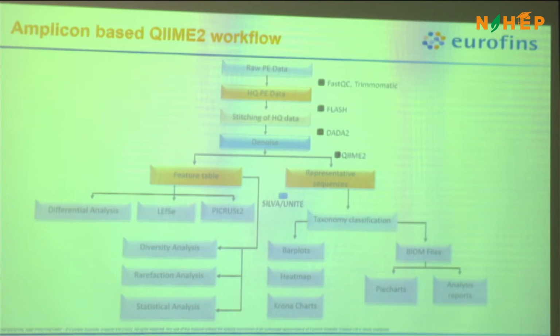of R2 are usually poor bases, but not in all the sequences. In the majority of them, the mean or median of that particular end of the sequences will be dropping to somewhere around 20, or will be close to 20. So we want to trim only that part of the reads, so that the amplicon which I am going to stitch and make is a good quality amplicon for identification of the bacterial species.